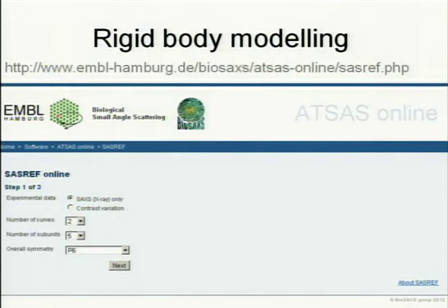So this program has an online interface. Basically, what you need is the data. You need to say how many curves you measured from different constructs, how many subunits you have, and what the overall symmetry is. I will demonstrate the interface later.